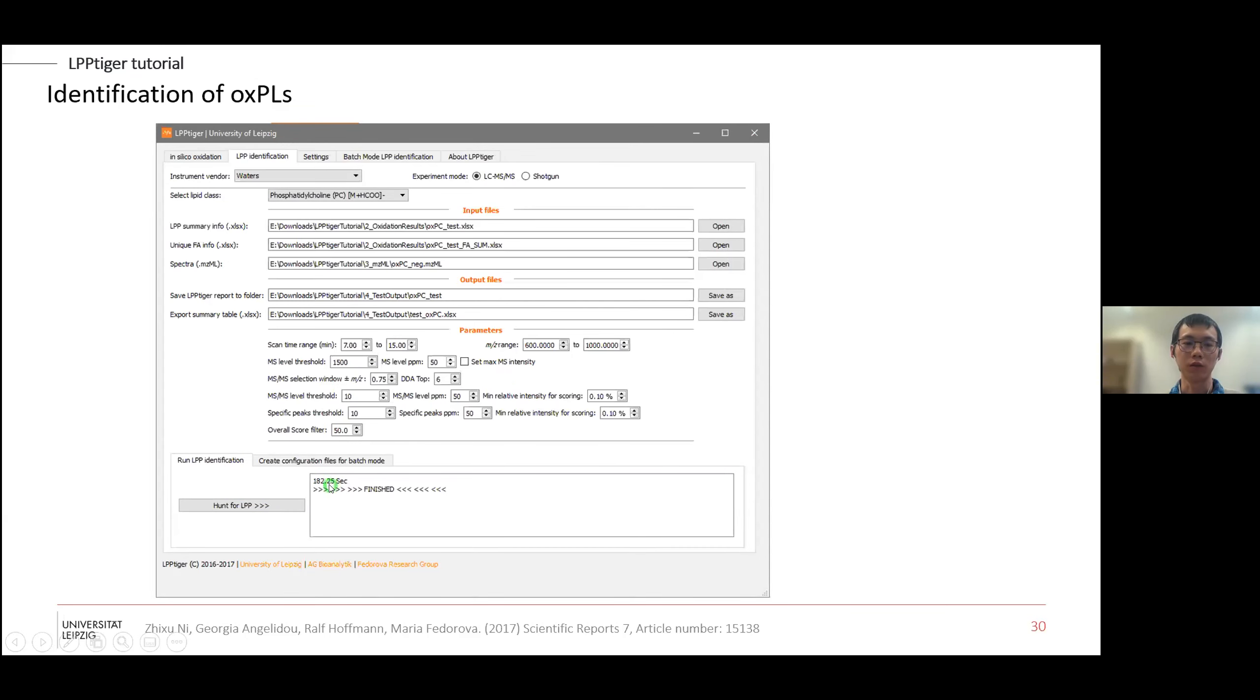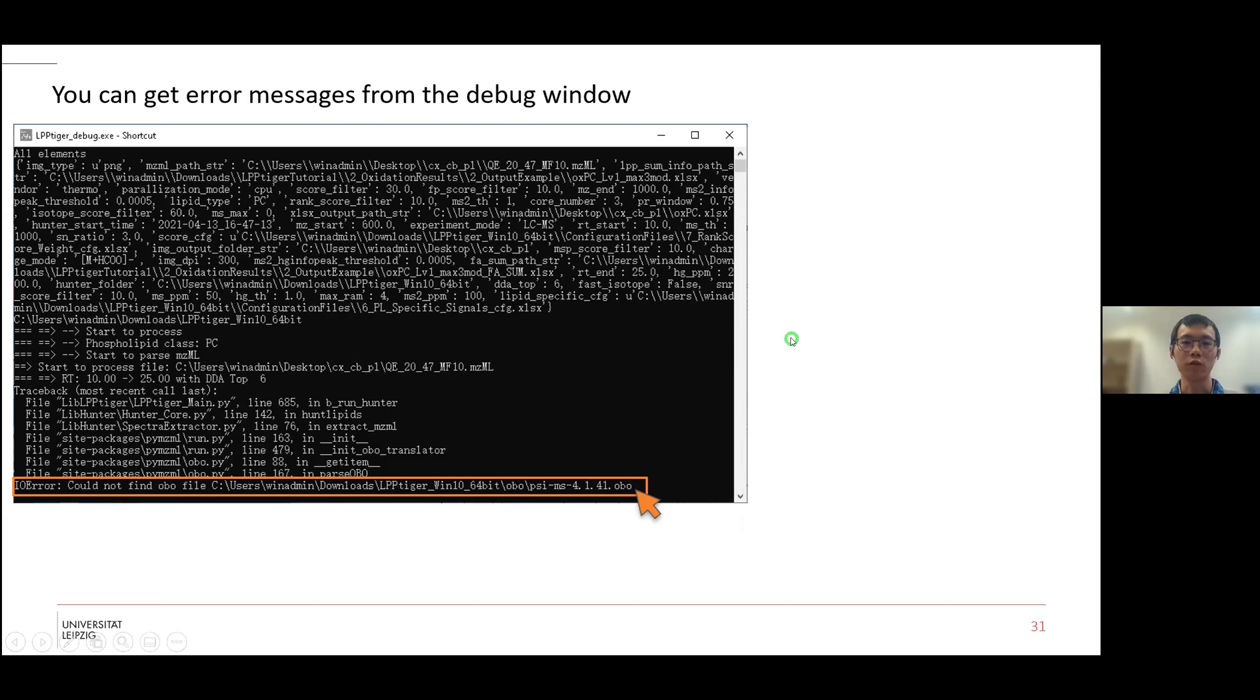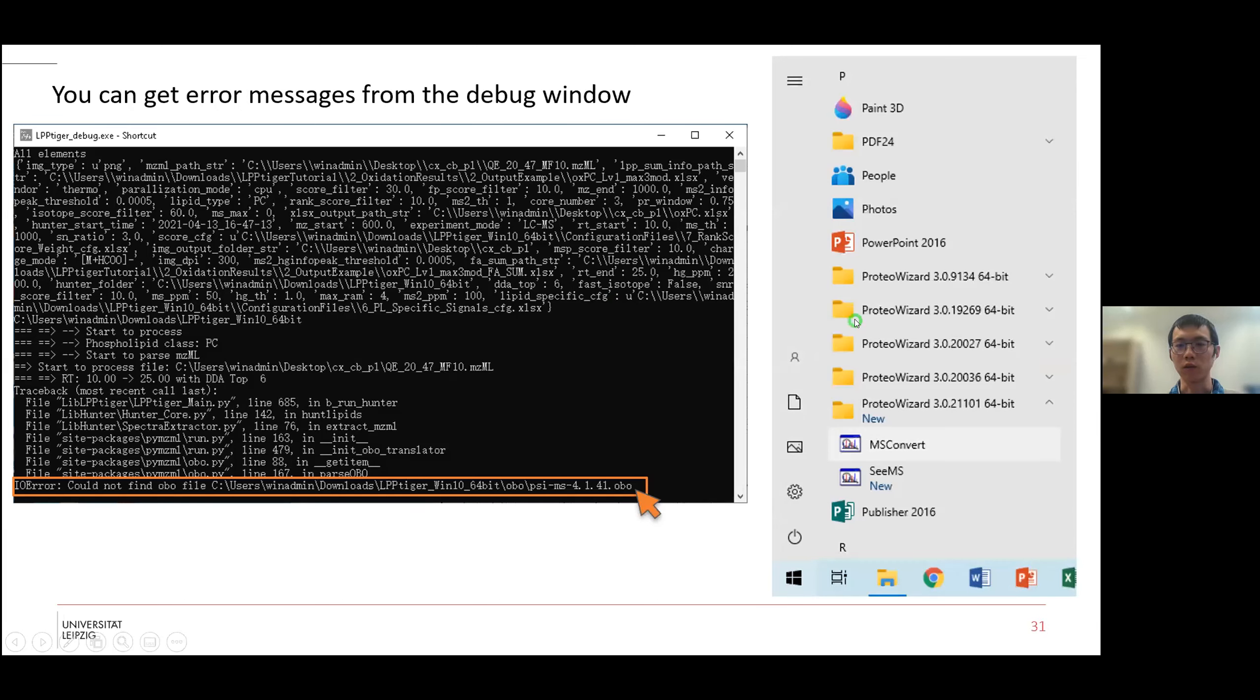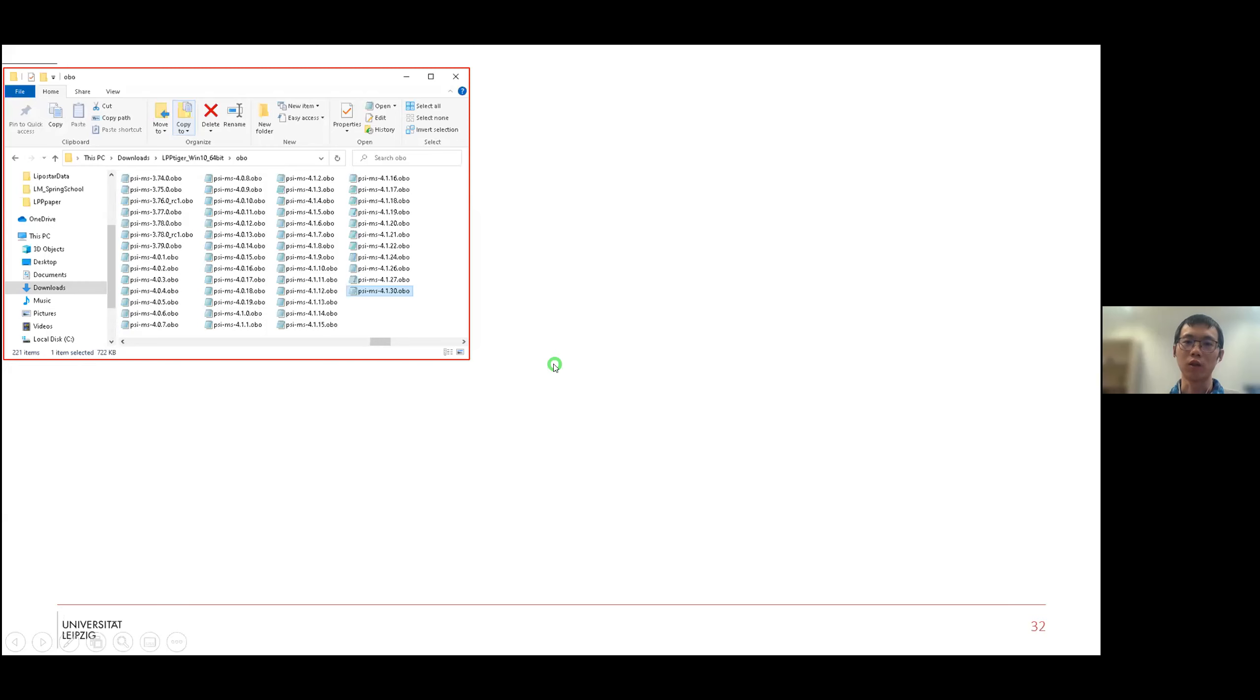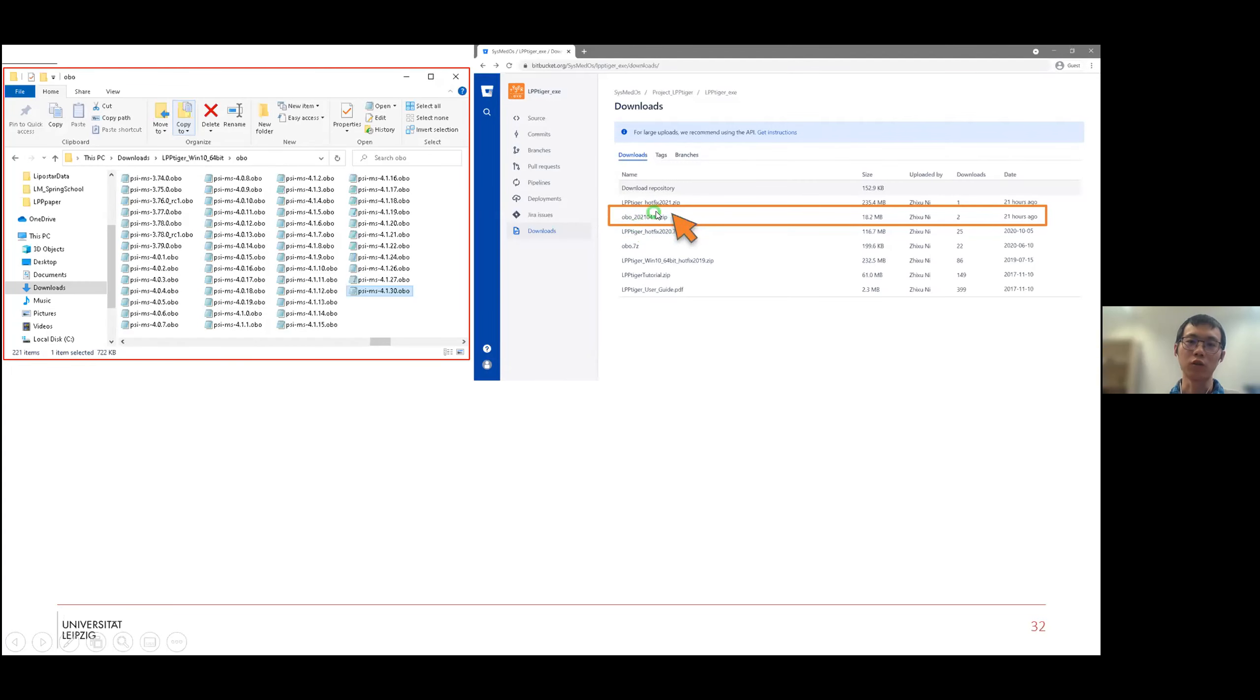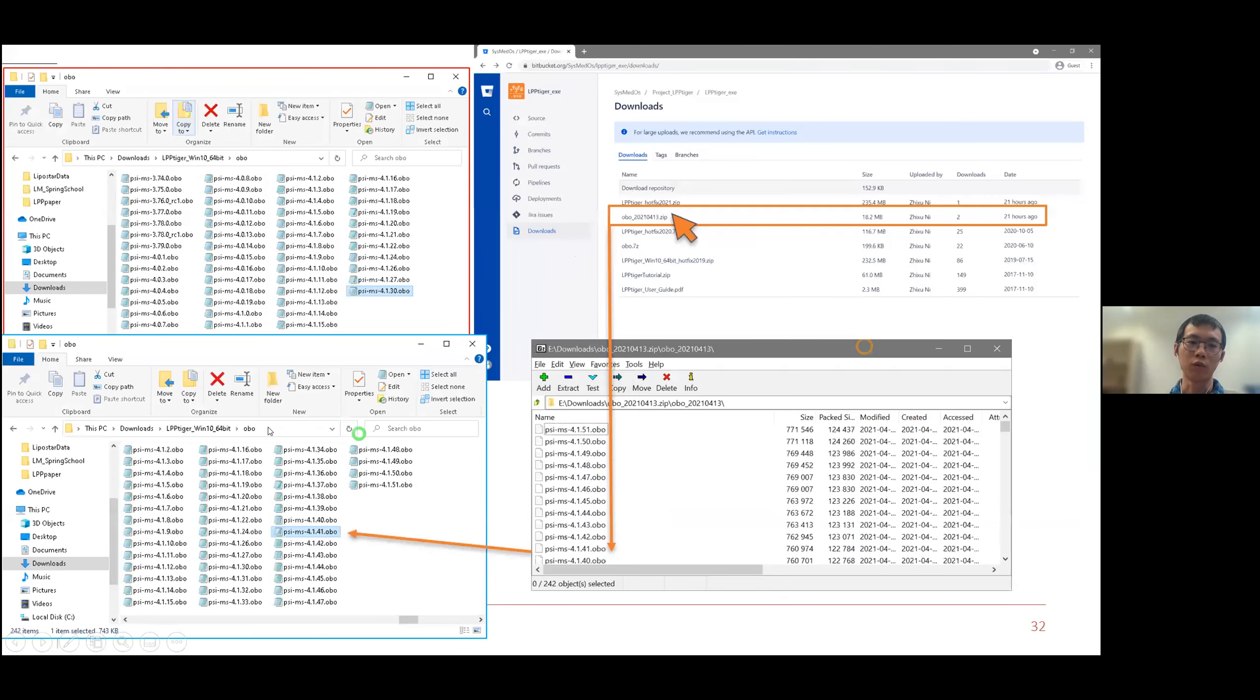When the run is finished, it will be displayed here. Then it says it's finished. Some common issue - if you are not getting the report, it's because there's an error from the MZML conversion. This is because MZMLs are updated several times per year. If you are using the ProteoWizard version which is working for LPP Tiger or other tools, we recommend you to keep that version for the whole project. Then you have the same version of MZML files, there's no problem. We are releasing these patches from time to time. You just download this one and put into the lib folder of LPP Tiger, and then you are good to go. You can rerun the analysis and you will get the results.